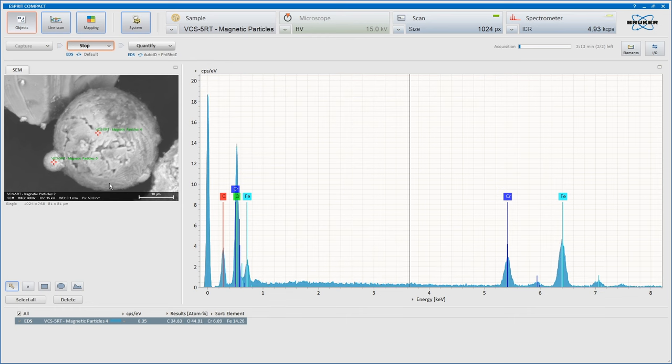So yes, this is broken up a little bit and we can see we have some chromium in there. And of course, chromium actually is quadruple carbon, actually. So if you take carbon and fuse it, you get magnesium 24, and if you fuse that, you get chromium 48. There we go.